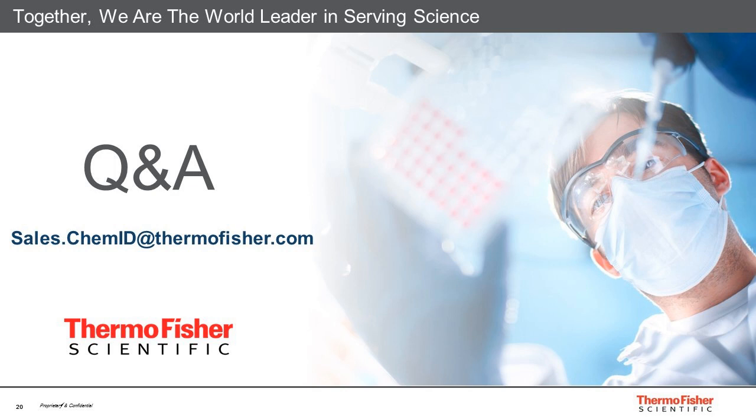Are the chemometric parameters similar to those of the NIR software? With our handheld near IR, we have our own chemometrics building program. It's a little bit different. It uses, I would say, more of a streamlined view compared to the one that we have here. But yes, it's the same parameters as what you're effectively doing with Eigenvector Solo. You're setting the spectral range, you're setting the acquisition parameters of the actual instrument, and you're building the algorithm that you want to use to do either an identification or a quantitative analysis.